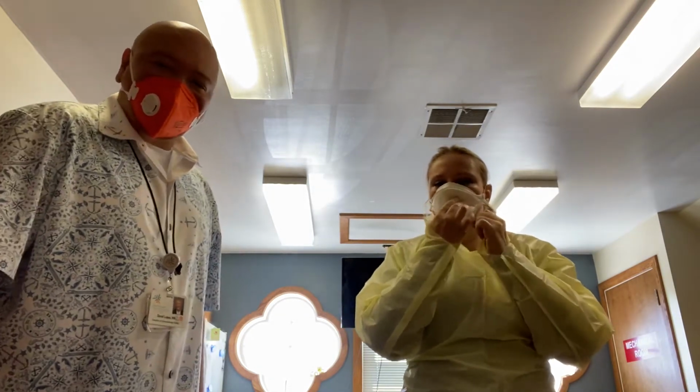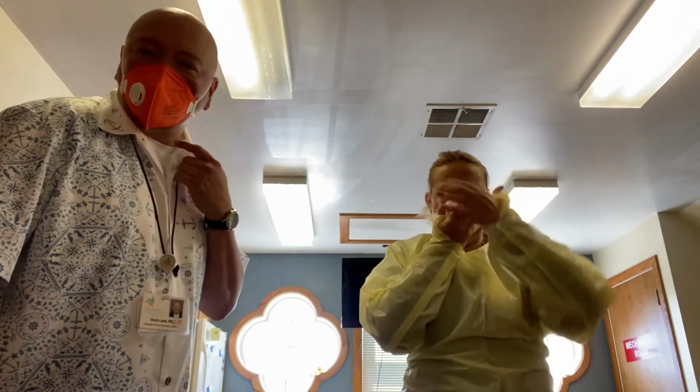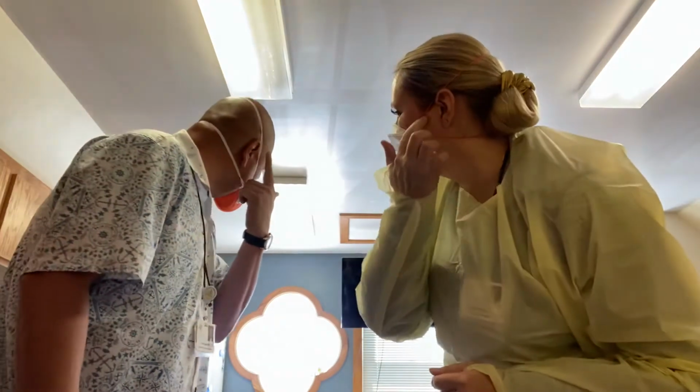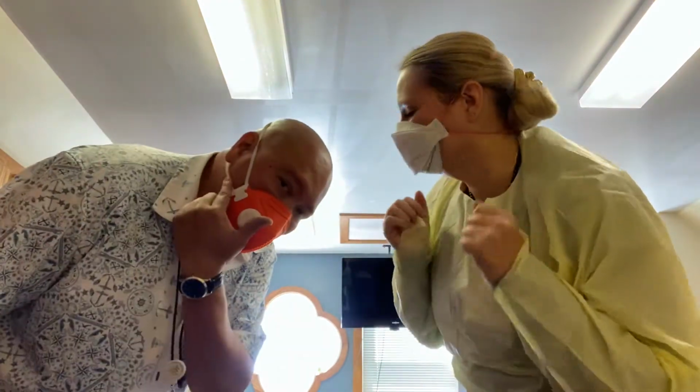Putting on an N95 is one up, one down, from here to here. So one goes up and one goes down. So you see my ear? One down, one up. Make sure it properly fits you.